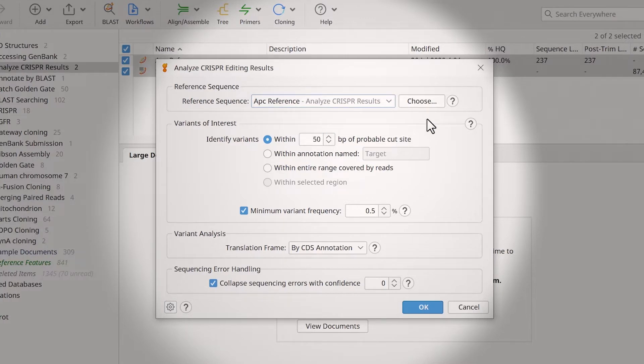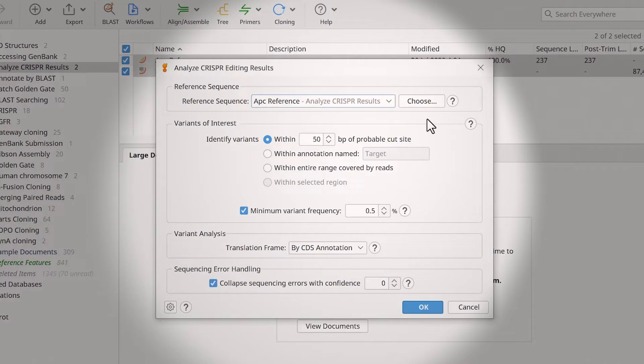The Variants of Interests section allows you to specify how far upstream and downstream of the CRISPR cleavage site to look for variants. You can also adjust the minimum variant frequency. This setting determines the minimum frequency of variants included in the results.